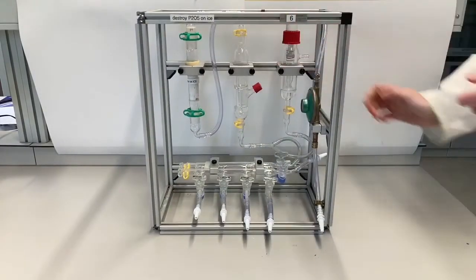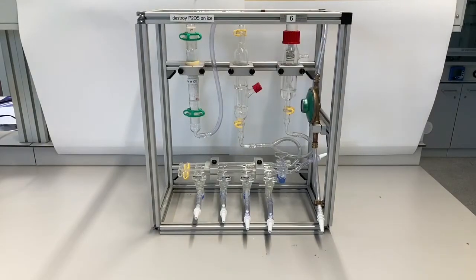In this video we will show you the parts of the nitrogen rack and how to use it to perform a reaction under nitrogen. The nitrogen rack has multiple parts that make sure it works.